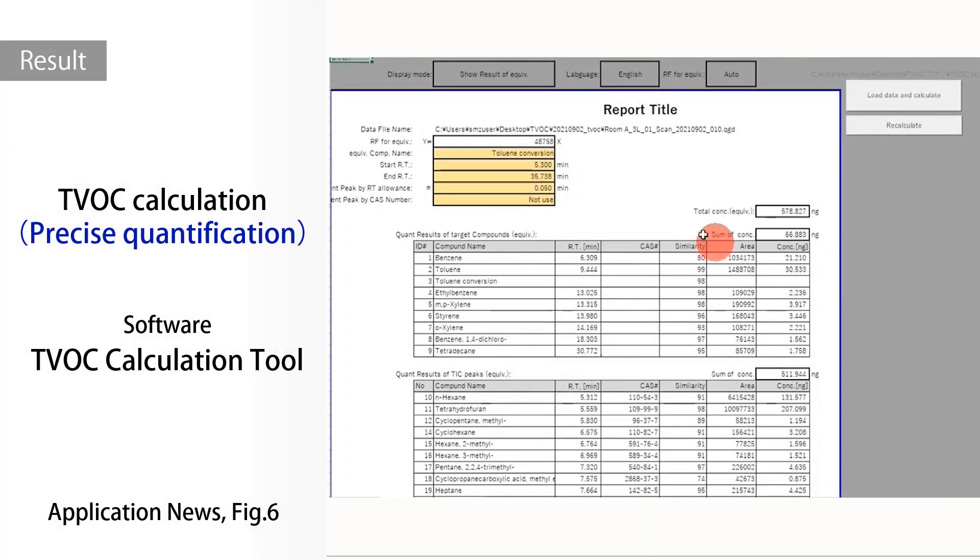The tool also has a function that switches the results from the toluene-equivalent to precise quantification. Precise quantification can be performed for those compounds that have been run with corresponding calibration curves. For those without corresponding calibration curves, toluene-equivalent values will be assigned, making the database versatile to any applications you might be interested in.